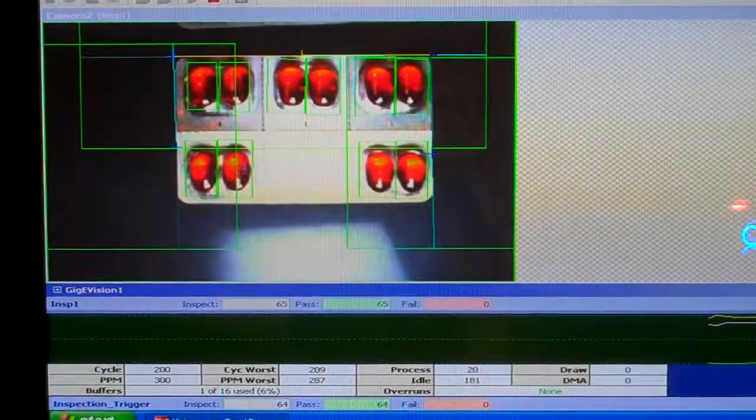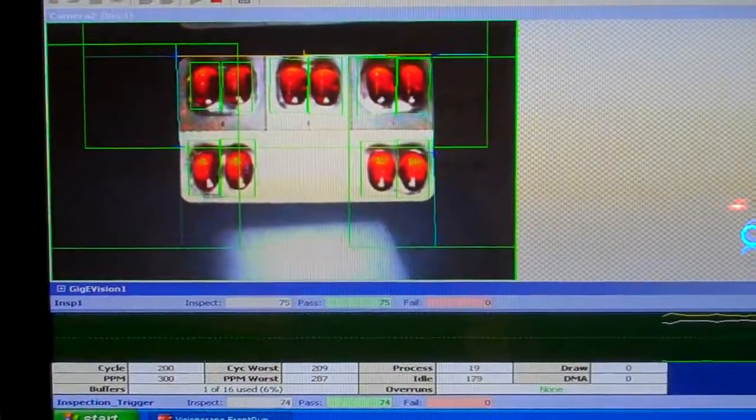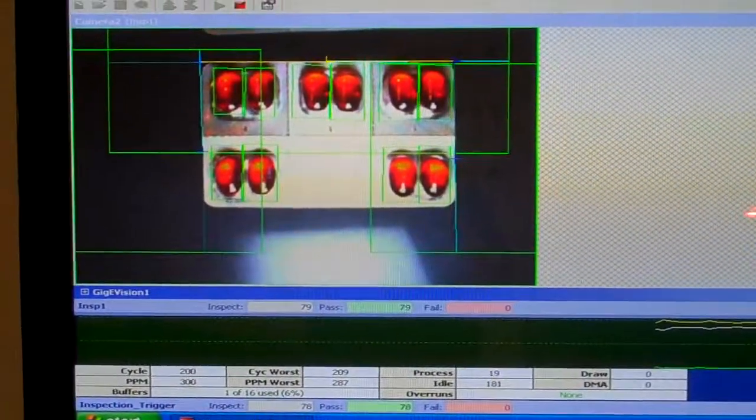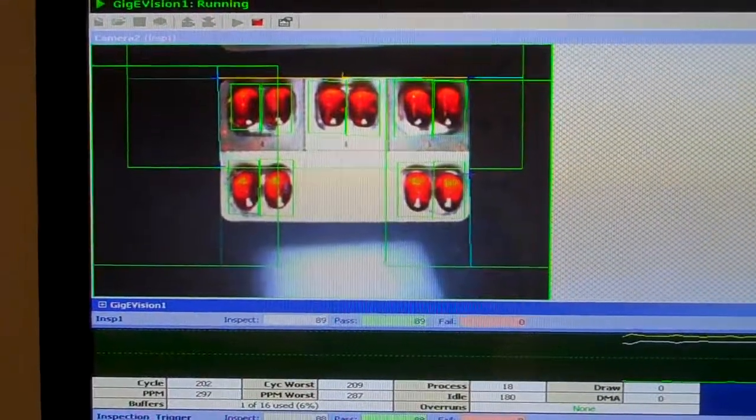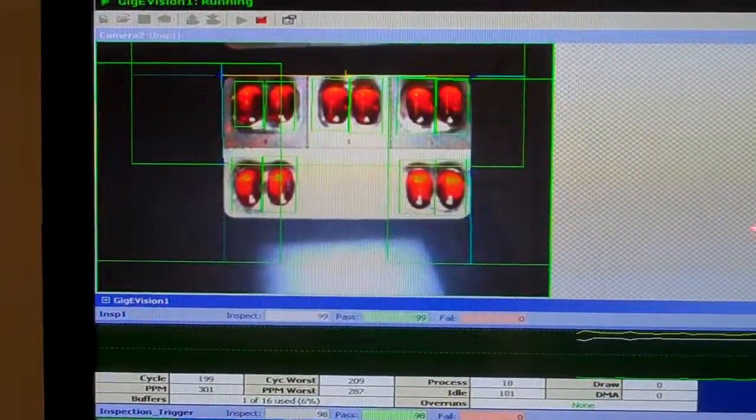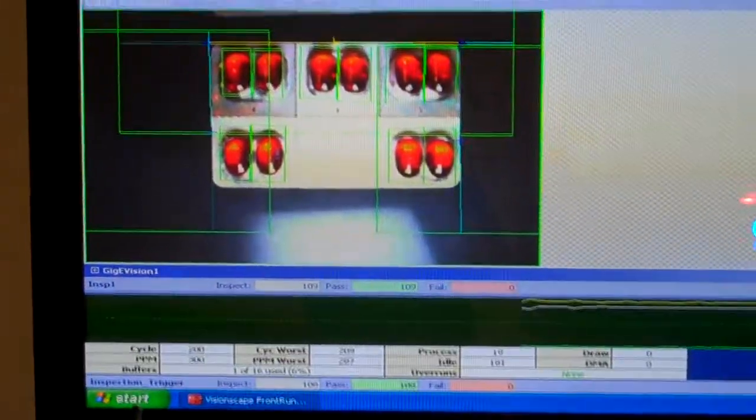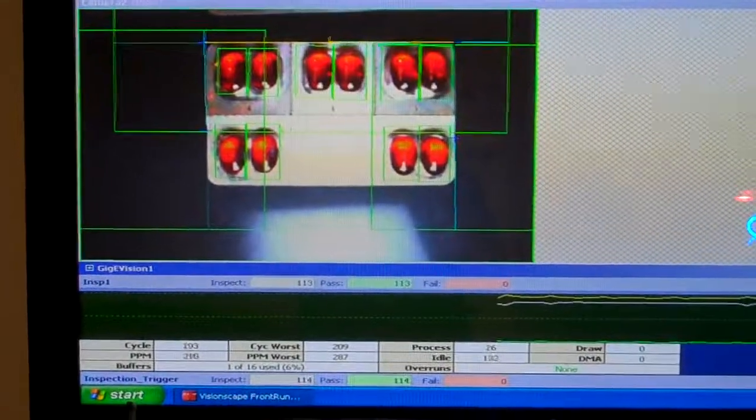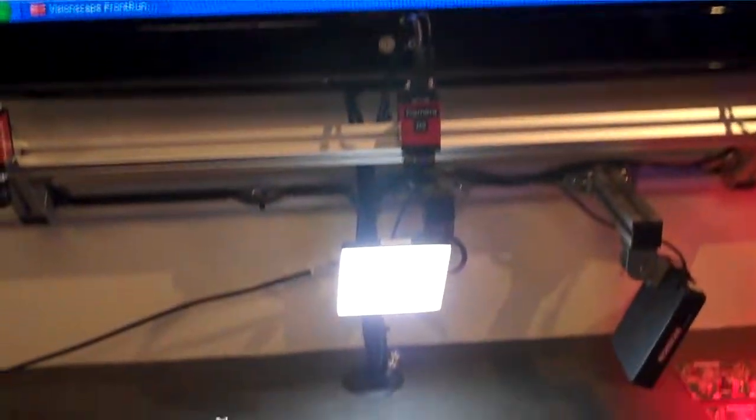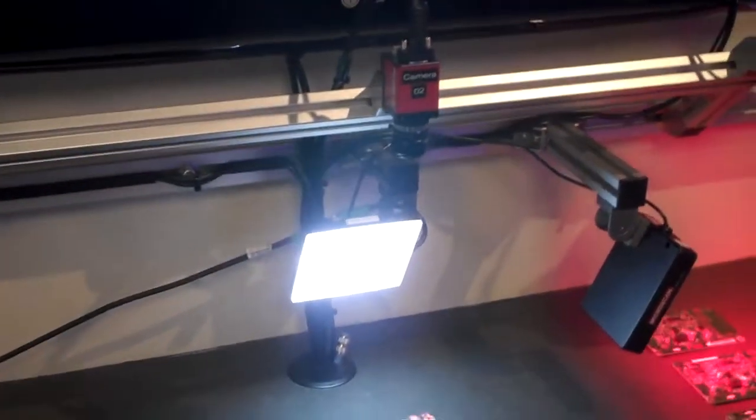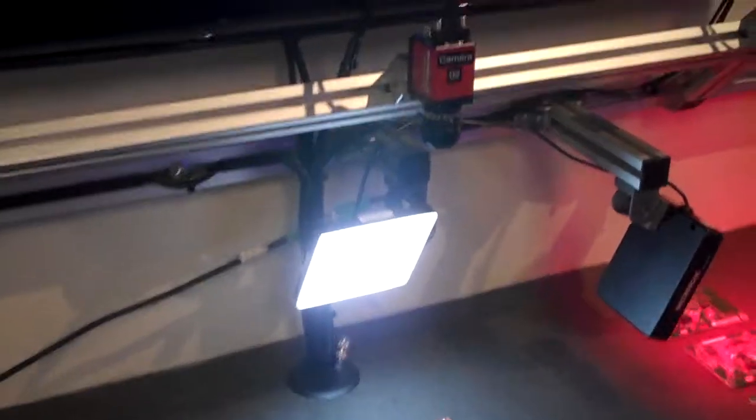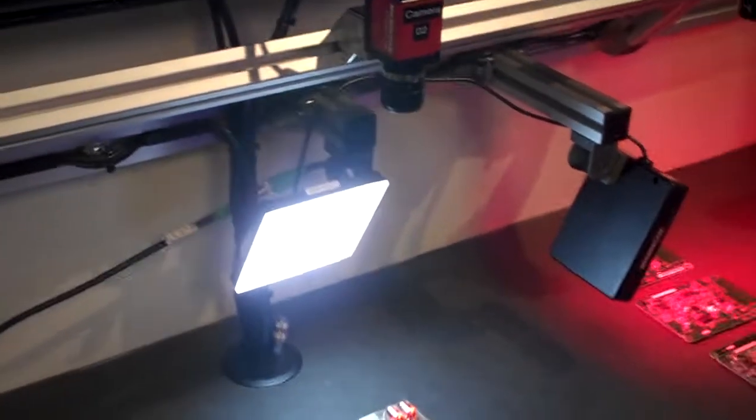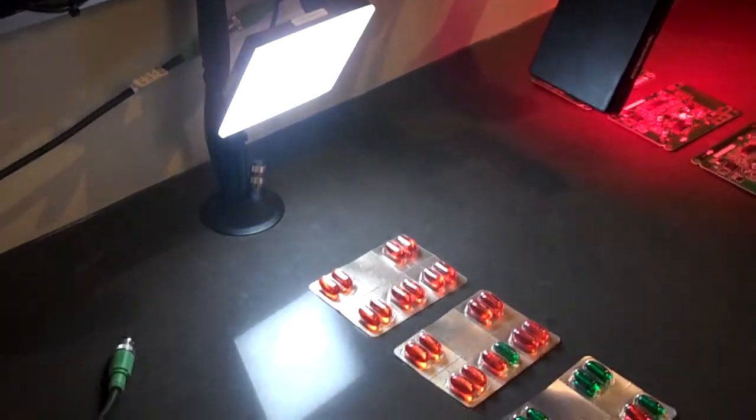Hello again, this is Andy Zozl, Vice President of Marketing here at Microscan. I'm in the Microscan demo room and I'm looking at a blister pack with pills. I'm using a geeky camera running Visionscape. I also have a 100 by 100 white backlight using it as a front diffuse.